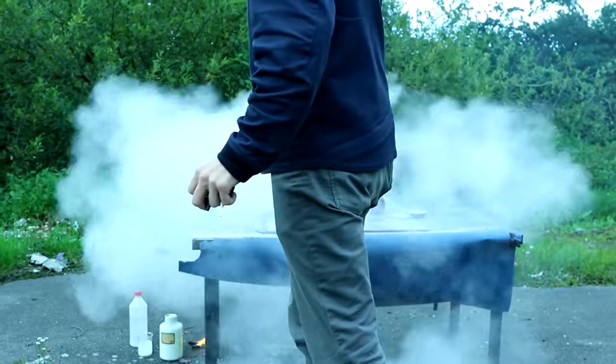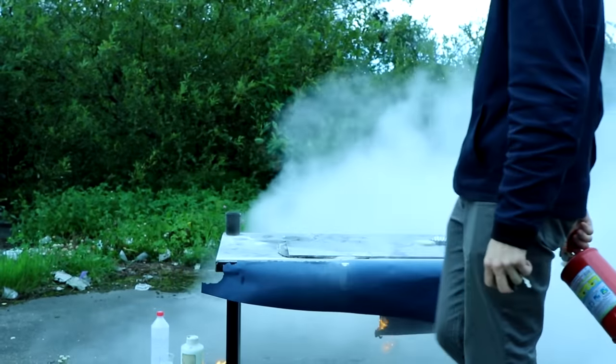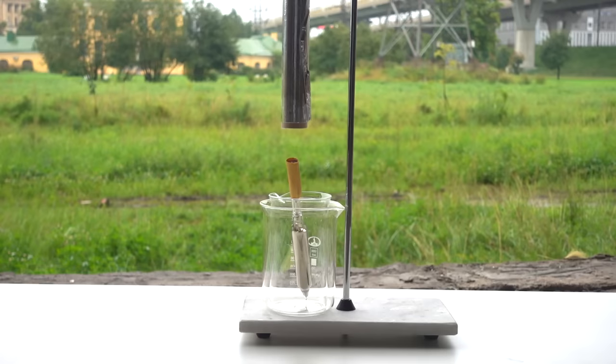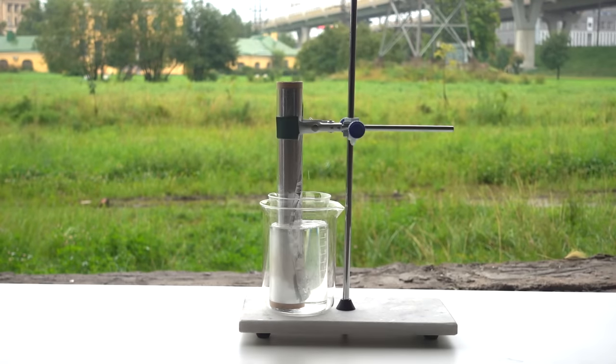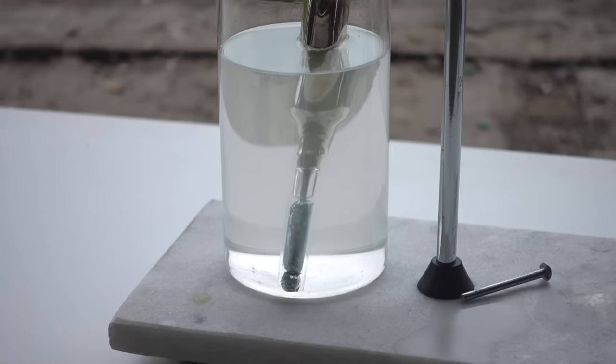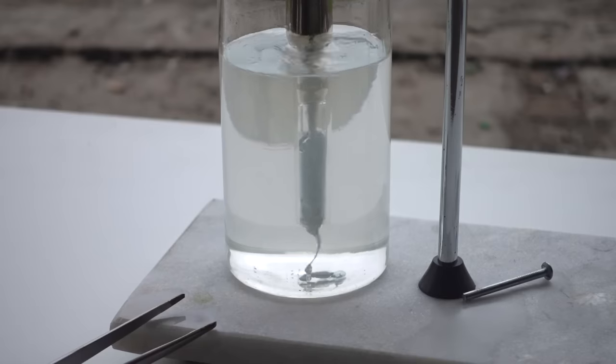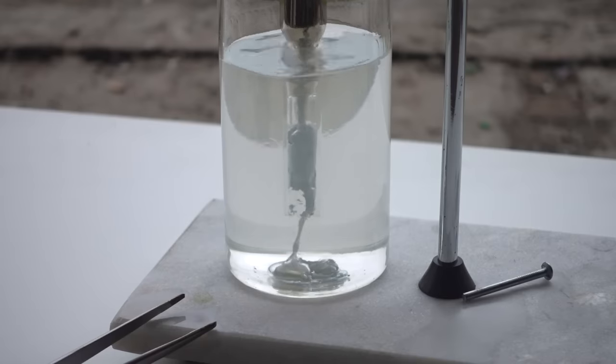For further experiments, we had to buy another vial of cesium. Now I decided to do things differently, breaking the end of the ampoule with a solid cesium and then heating kerosene. This turned out well.